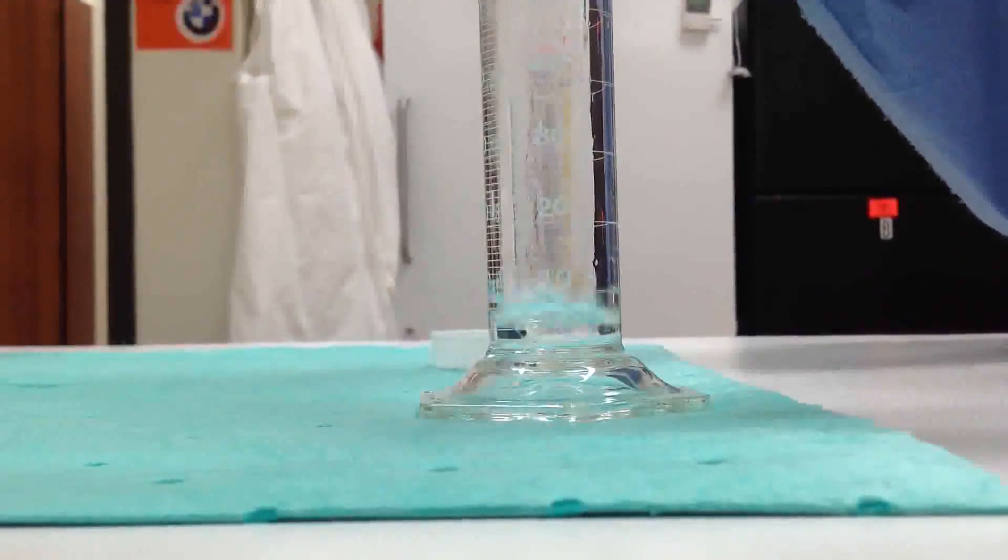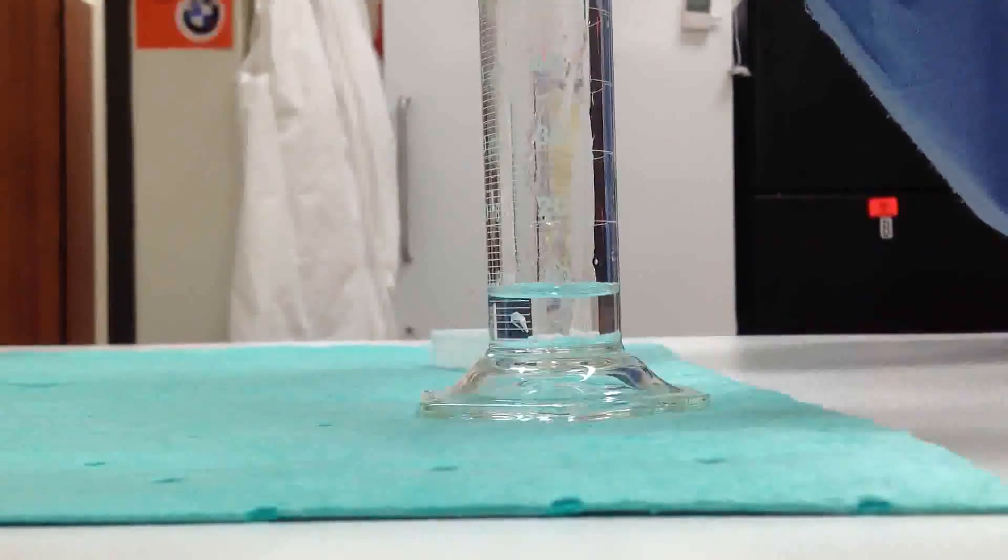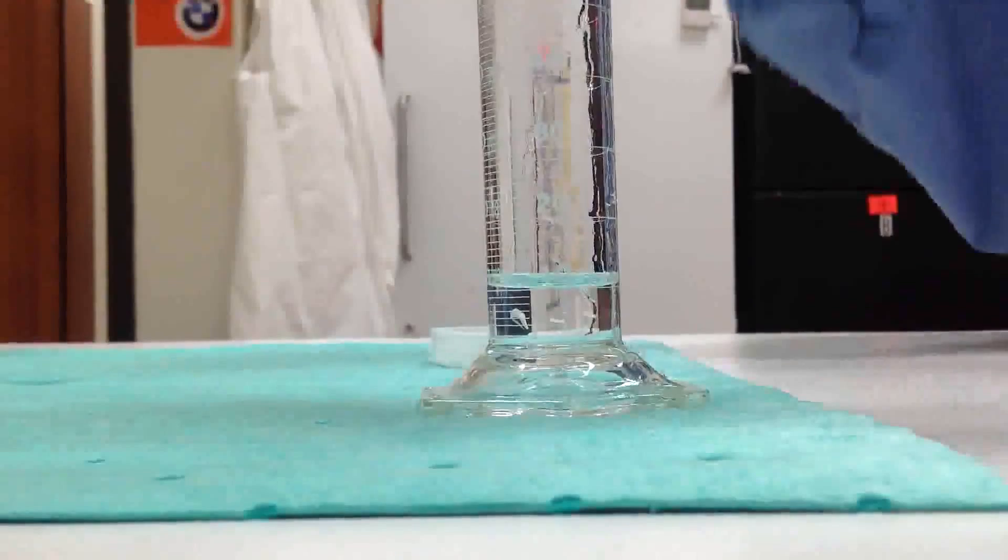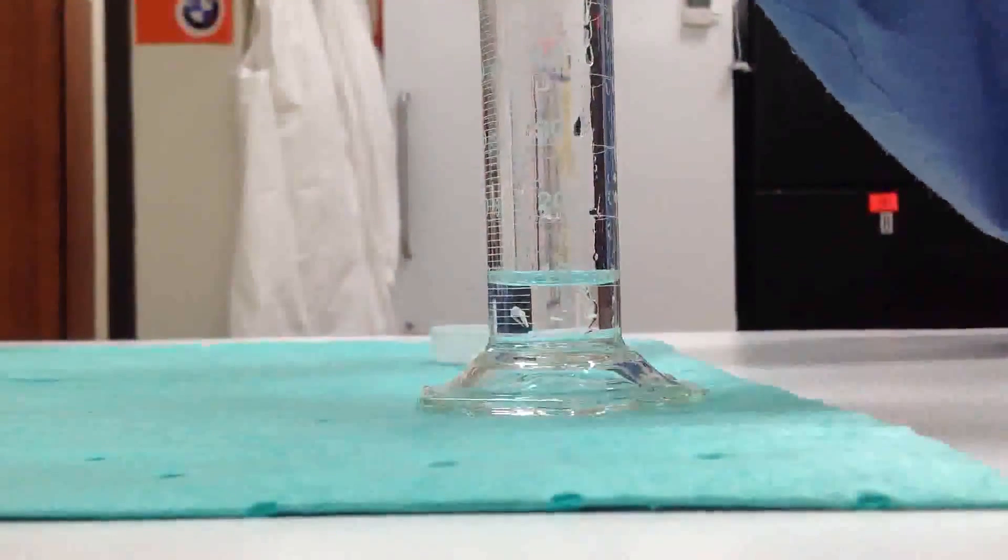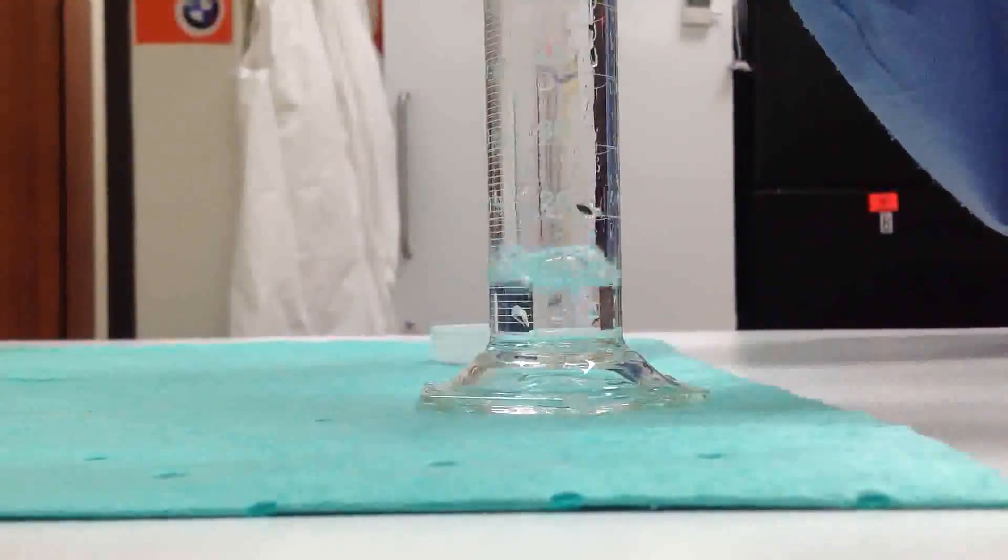Then we'll use a transfer pipette to top it off until we have a good meniscus reading. And remember, the meniscus is the bottom of the arch.